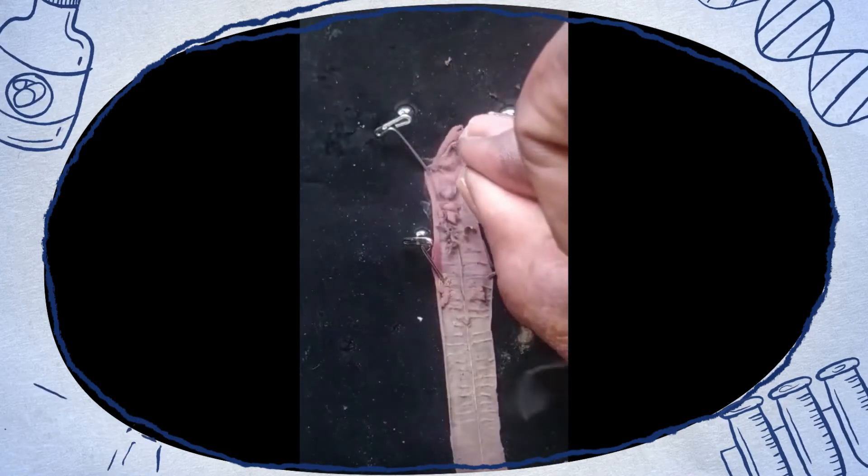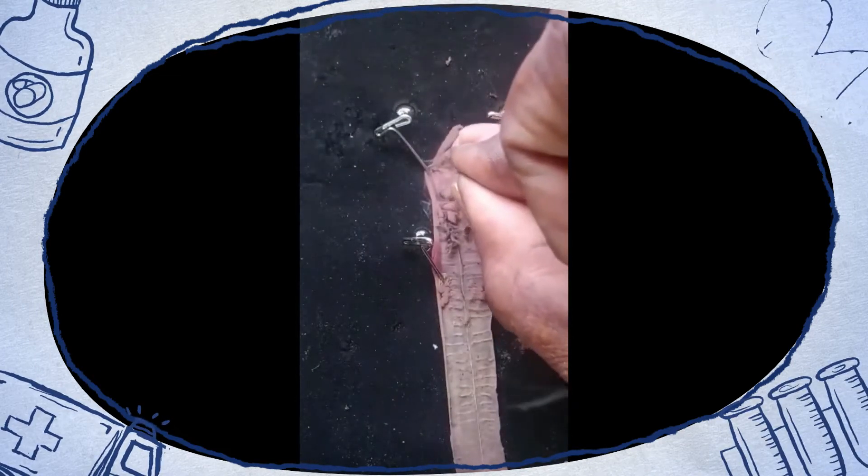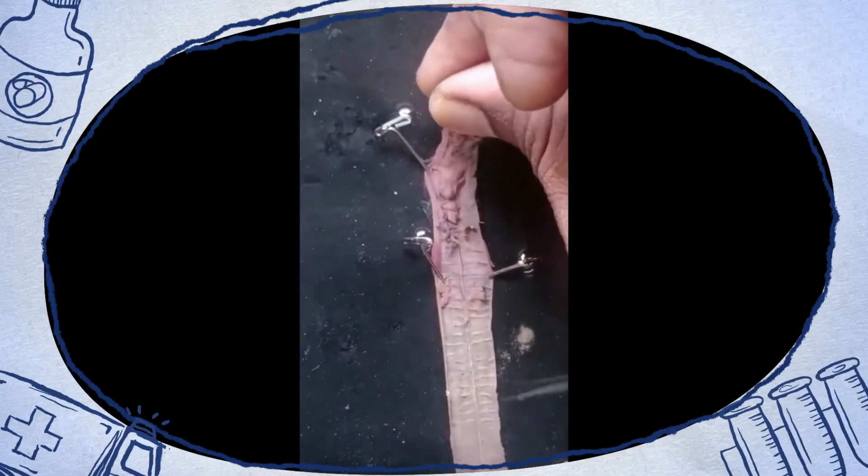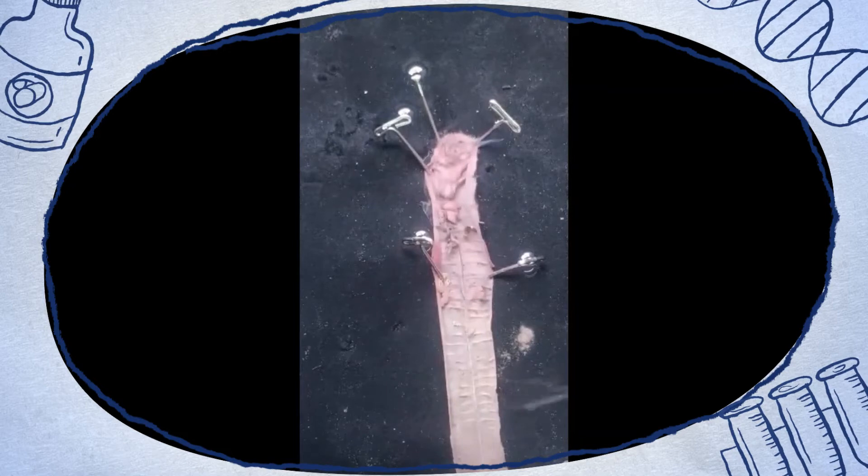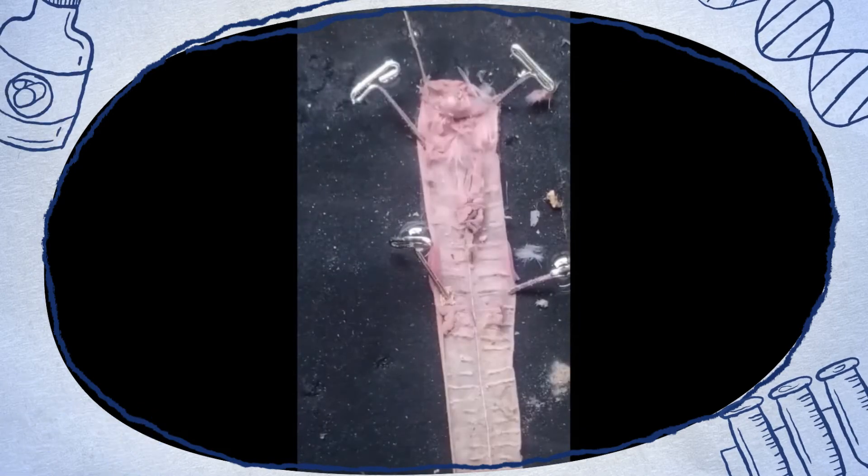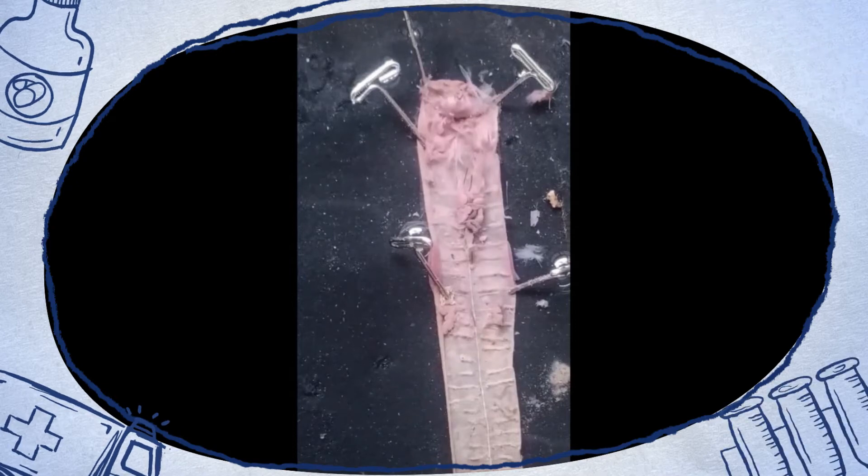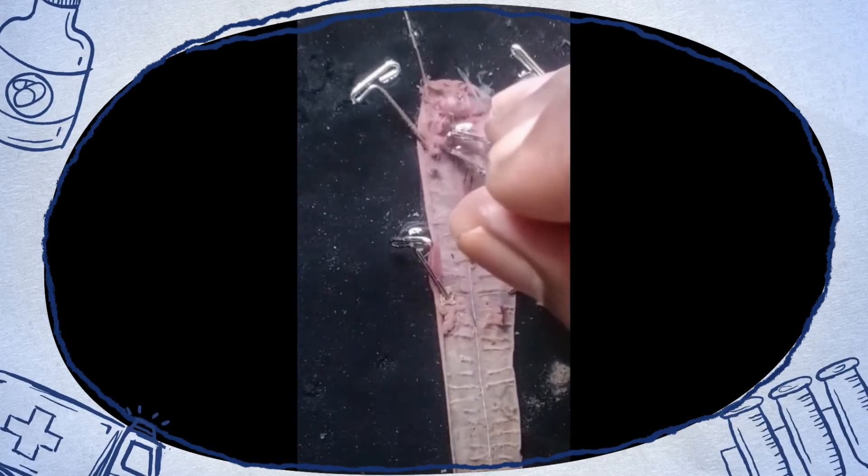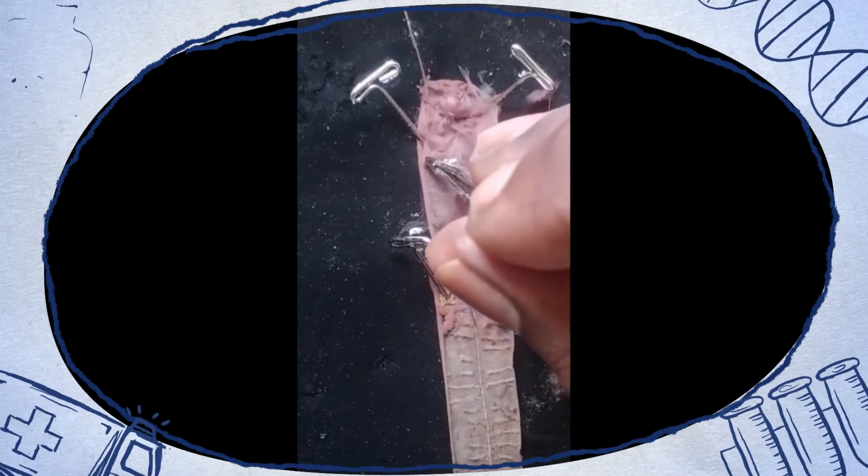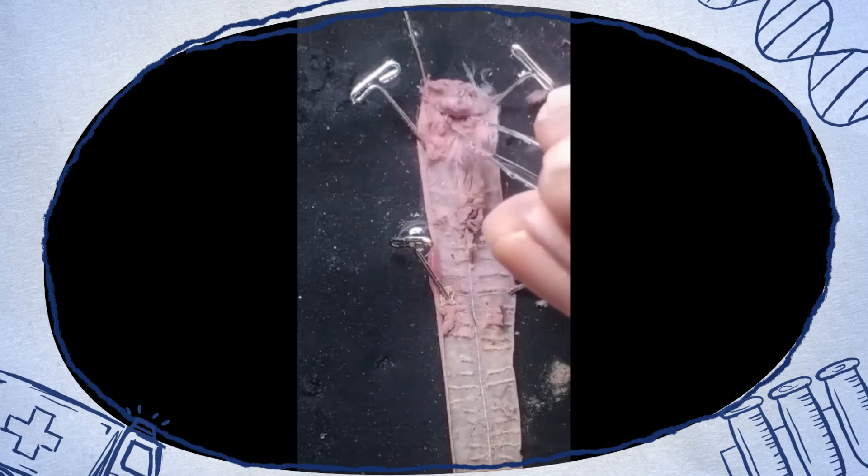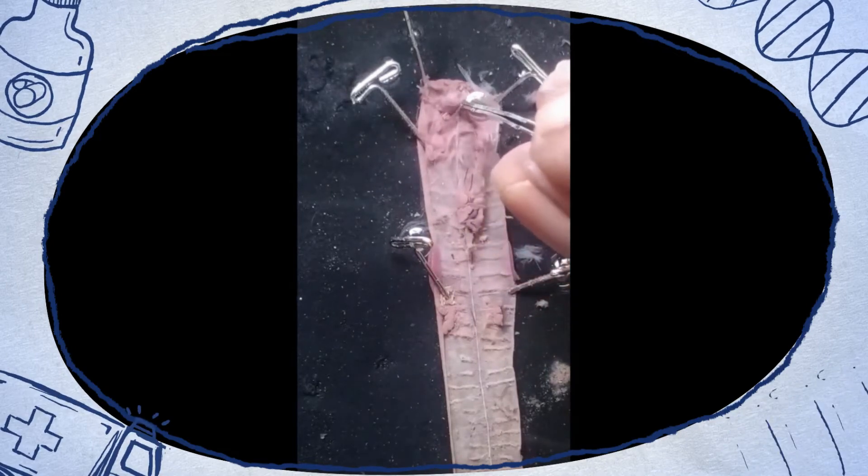As you open it completely, you will be able to locate the nerve ring at the anterior end.